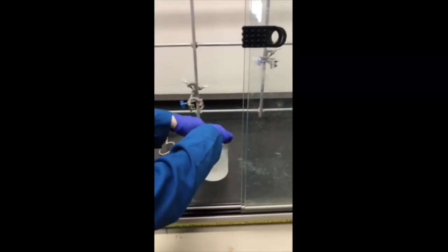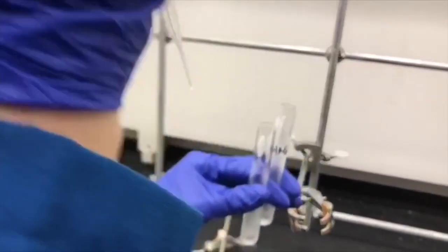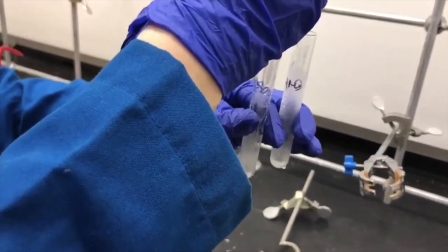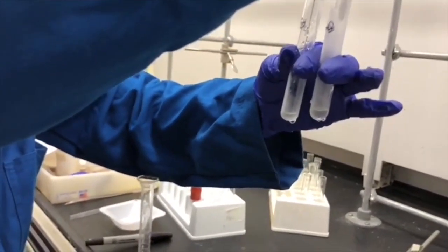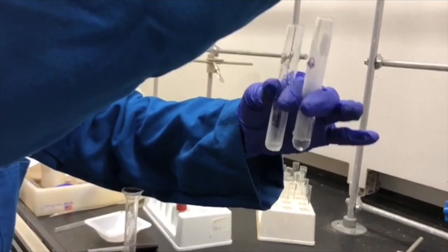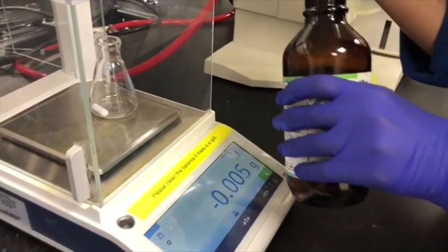We leave both of those acids in the ice bath for 15 minutes. After it's been cooled, we're going to add sulfuric acid dropwise to the nitric acid test tube. And then we're going to keep this mixture in an ice bath again for 10 minutes. And we weigh out about 0.55 grams of methyl benzoate.